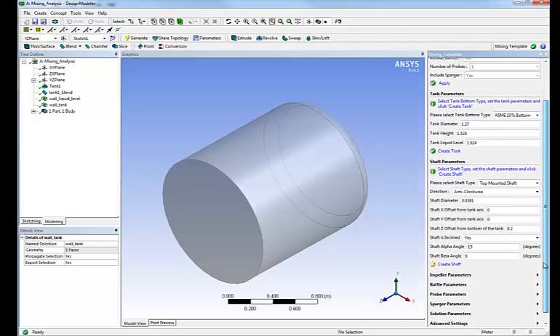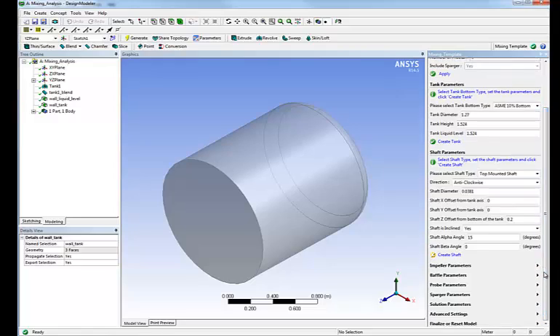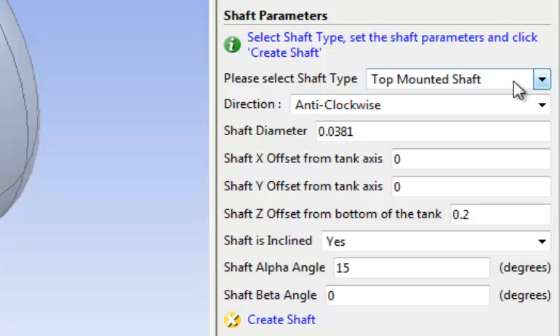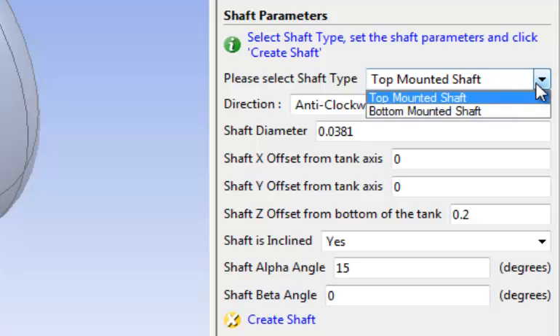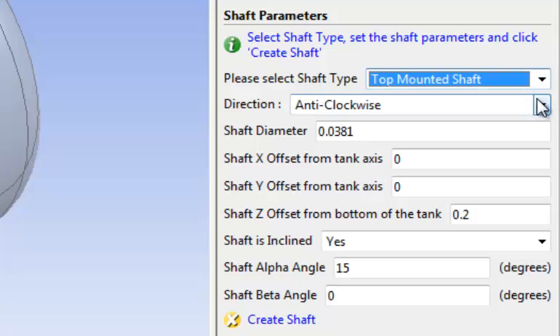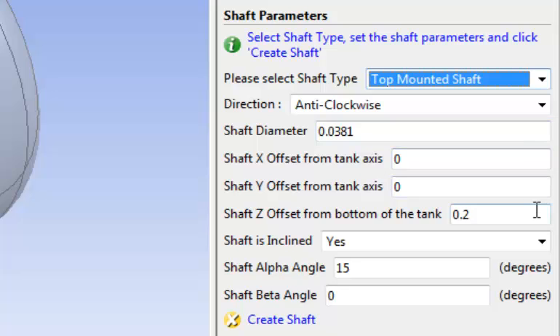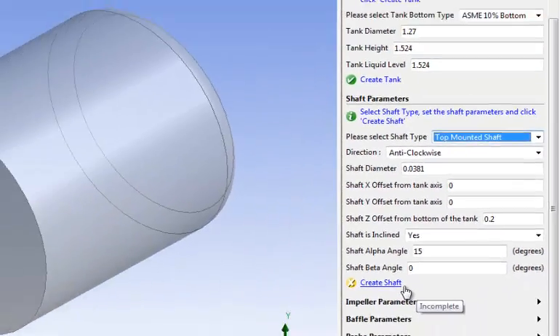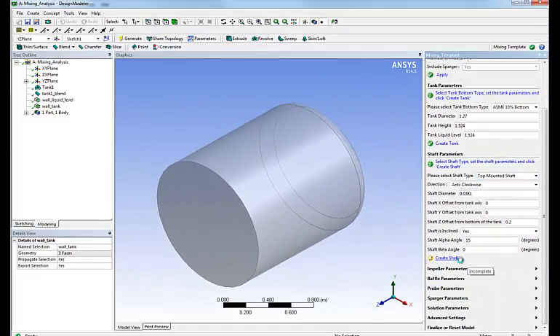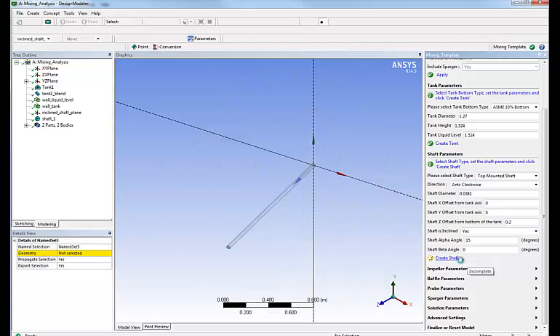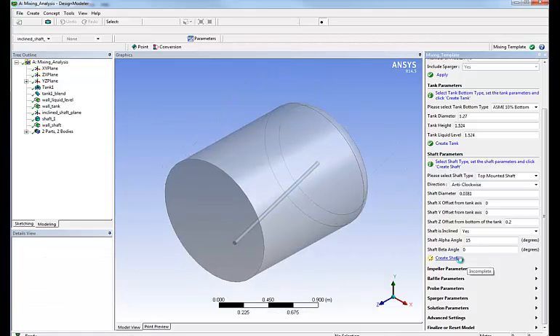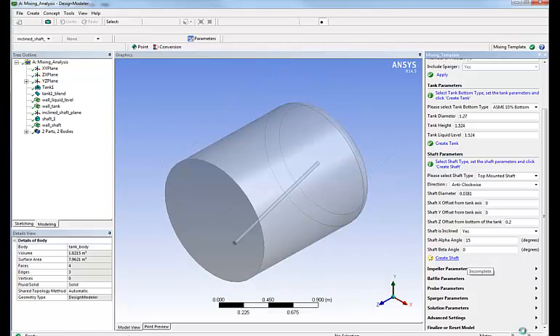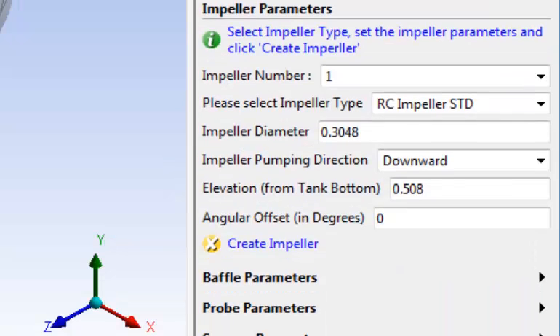The next thing we'll do is define the parameters and the characteristics of the shaft. It can be top or bottom mounted. In this case, it will be top mounted. We can choose its direction, dimension, location, orientation with the main axis of the tank, etc. Same thing. Once everything is filled in, we simply click on create shaft and as you can see in front of your eyes, the shaft is being created automatically.